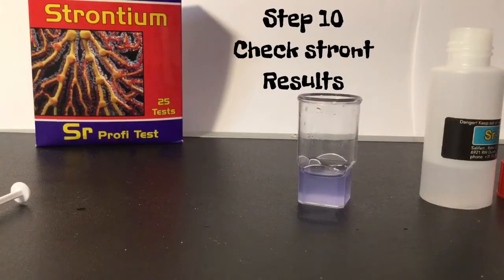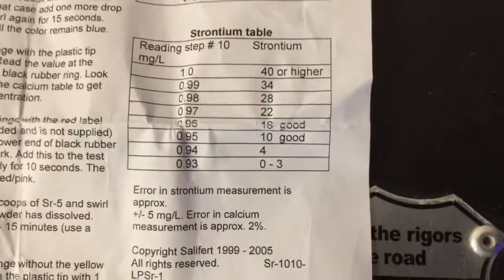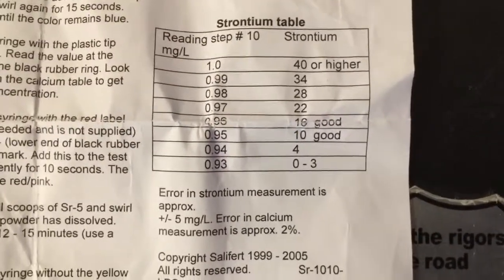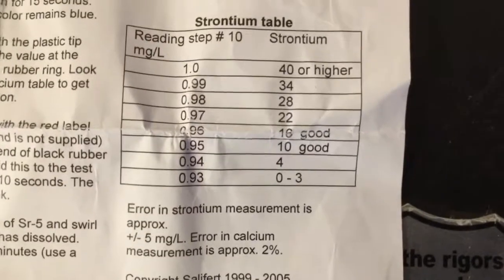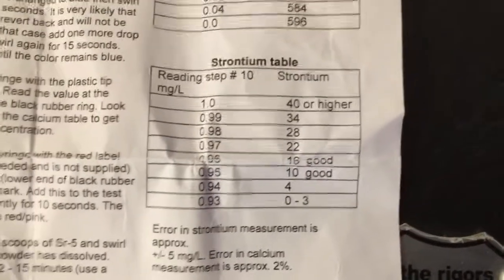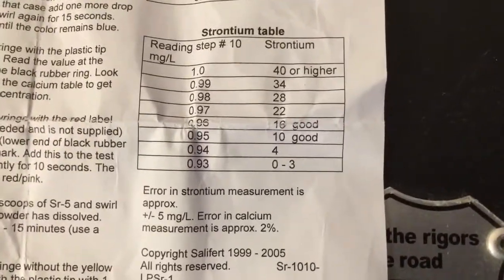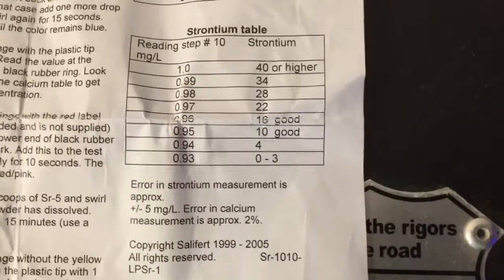Looking at the chart that comes with the kit, I'm at the bottom, which means my strontium is kind of low. The highest I was able to get my tank up to on this kit was 0.94, which is a level of four on the strontium chart. Everything seemed to look a lot nicer after dosing strontium — I think my tank was depleted of this trace element because I don't do a lot of water changes, I just dose and keep my nitrates and phosphates low.